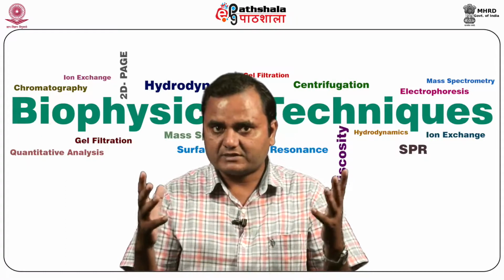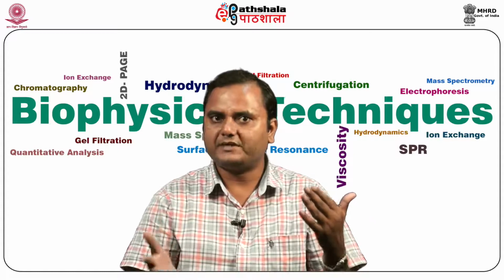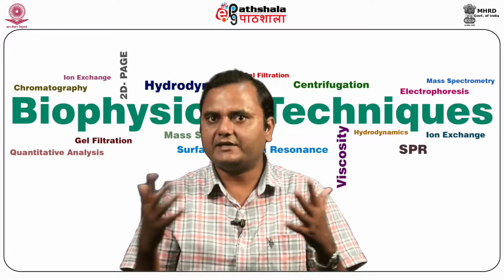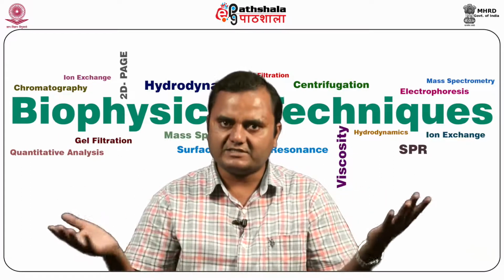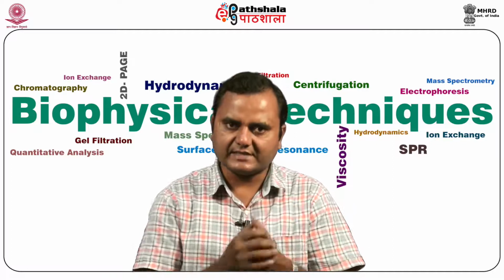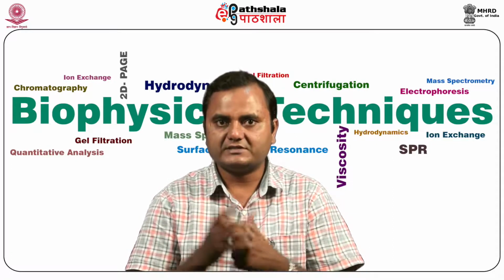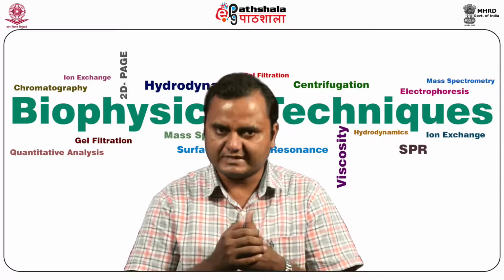If you talk about its components, the analytical centrifuge is actually the preparative ultracentrifuge coupled with an optical system. So it is simply a preparative ultracentrifuge that rotates at a very high speed, and it is coupled with an optical detection system which gives you a dynamic picture of the molecules inside the sample, that is used to measure the sample concentration inside the centrifuge during or after the sedimentation process.